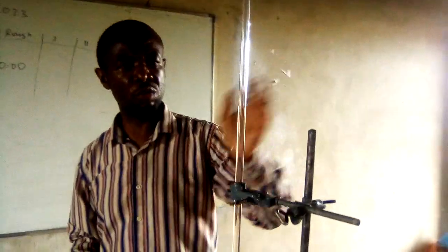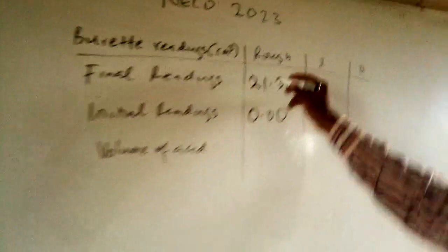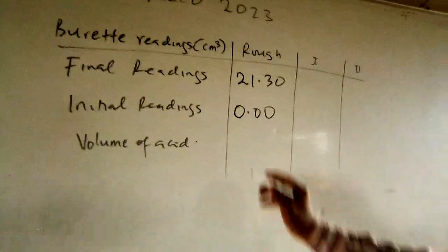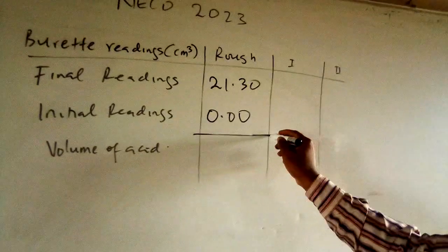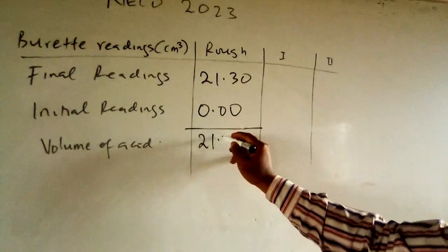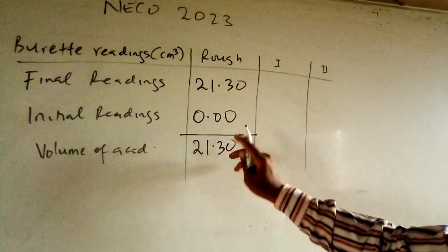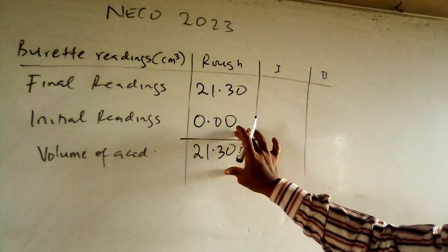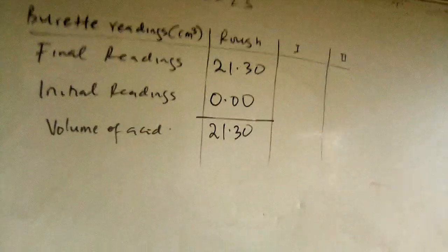The endpoint is indicated by an orange colour change. The final reading is 21.30 and the initial was 0.00, so subtracting gives a titre of 21.30 cm³ for the rough titration.